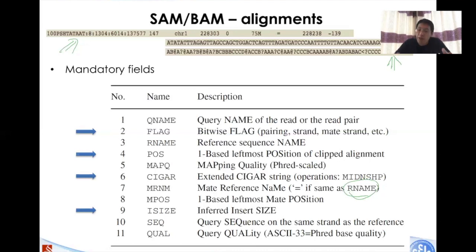Essentially, if you look at these files in a little more detail, you will find that the BAM file actually contains all the information of the FASTQ files if you decide to include all this information in the BAM file. And in the FASTQ file, this will be the sequence query name and the reference information, the nucleotide sequences, as well as the quality information.